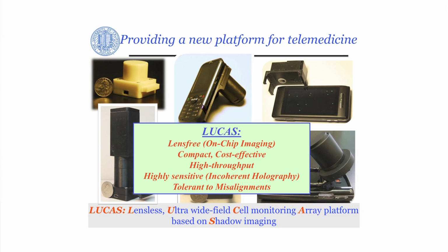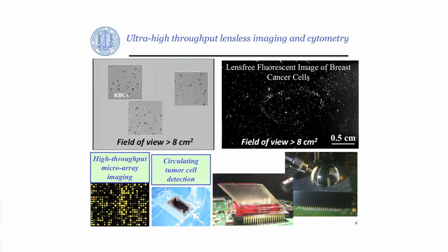They're not really sensitive to dropping on the floor. They're pretty well designed because they work based on a unique principle that is actually incoherent or partially coherent holography. So these are holographic lens-free microscopes. Besides telemedicine, you can use these for advanced settings as well, for looking at extremely large areas using non-conventional on-chip lens-free imaging designs. Could be very useful for extremely wide field imaging of, for instance, rare events, rare cells.